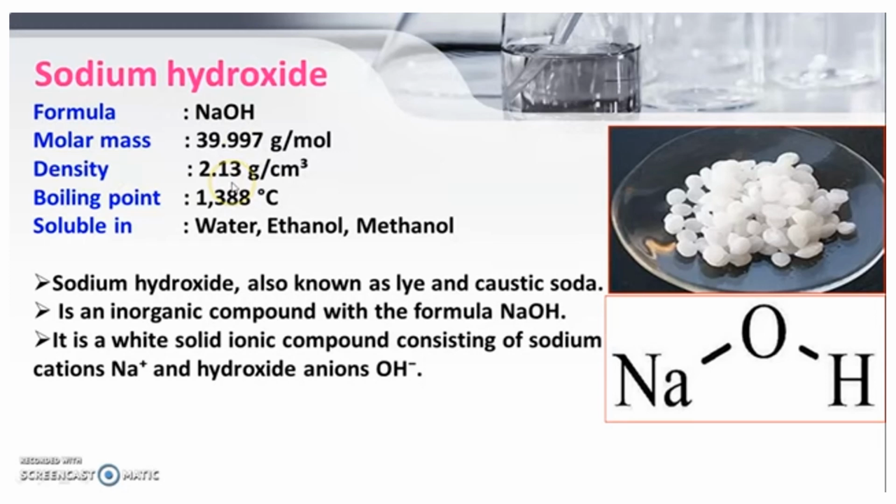Once you open the container of sodium hydroxide, within a minute it becomes liquid, because it is a hygroscopic substance and easily absorbs water or humidity from the environment. Therefore, when weighing sodium hydroxide, be careful to close the container immediately after you take your sample.